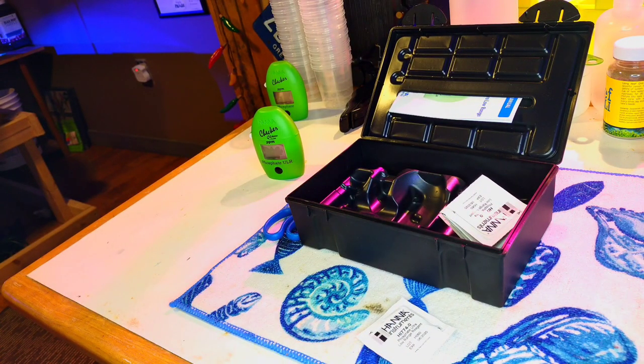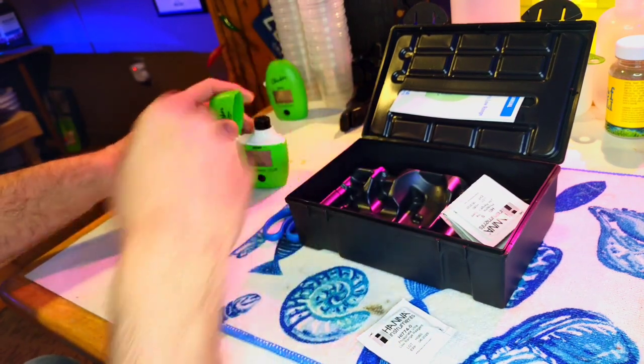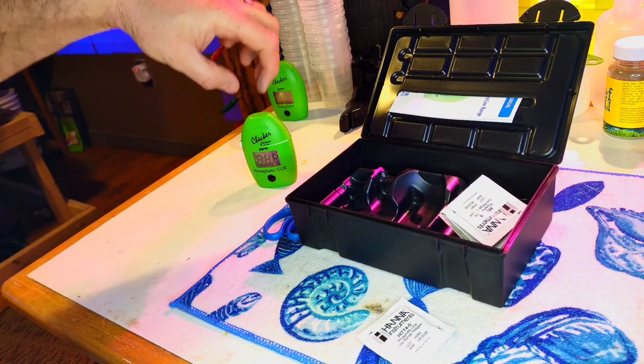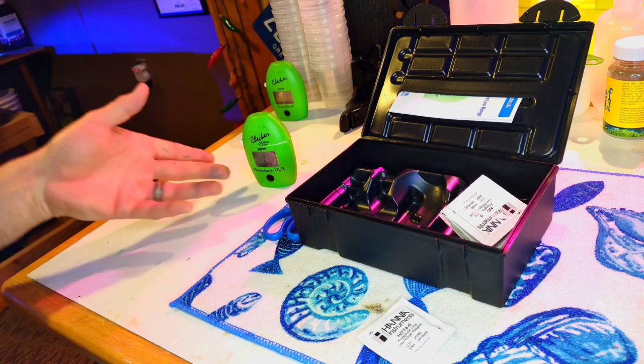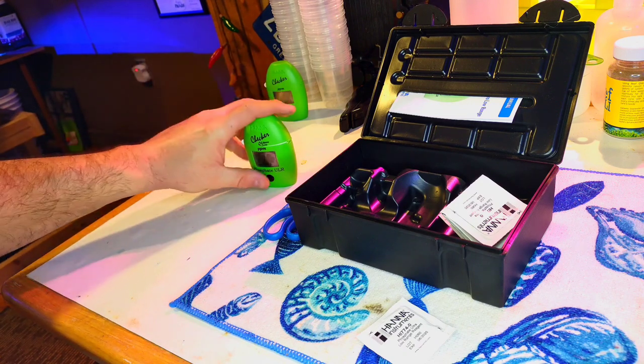Clean off all your fingerprints. If you have a really scratched-up vial, I suggest getting a new one. I like to keep my 10 milliliter mark in the front — you don't have to, but that's what I like to do so I know which way it is. You can put it in the back if you want. I just do that so I know it's in the same spot every time.